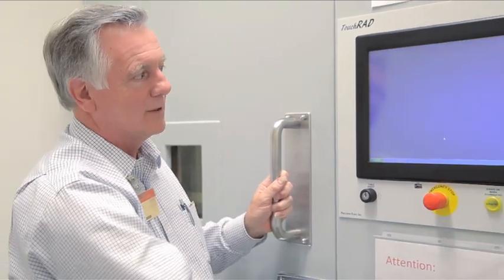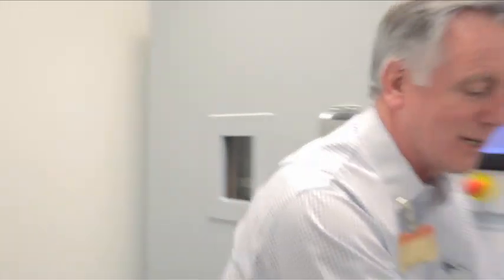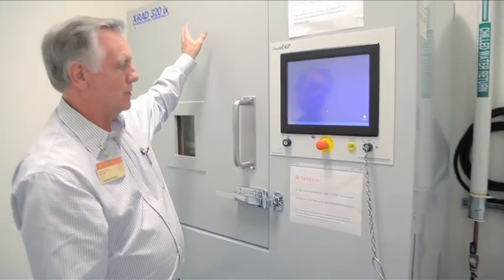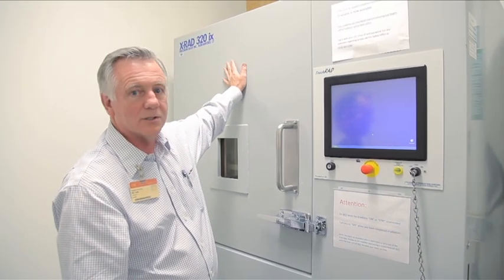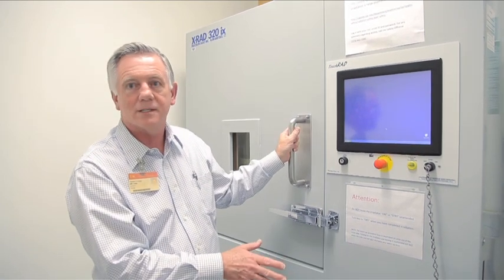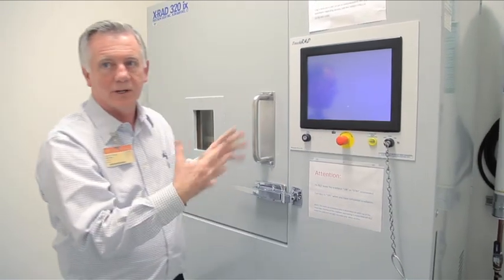The screen will go blank and the machine will eventually stop. Don't worry about a continued noise — it's actually a cooling unit that's cooling the oil that cools the generator. That will go on for another 10 to 15 minutes after you're finished. So long as you've turned it off, you're clear to go.